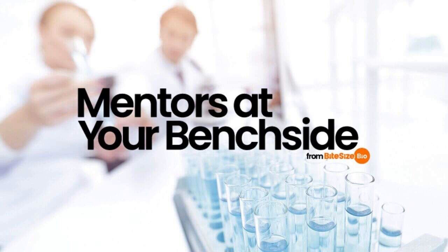Immunofluorescence staining is a popular and extremely powerful detection method. However, achieving publication quality immunofluorescence, or fluorescent antibody staining, can get tricky. It's therefore important to ensure you have the right controls.